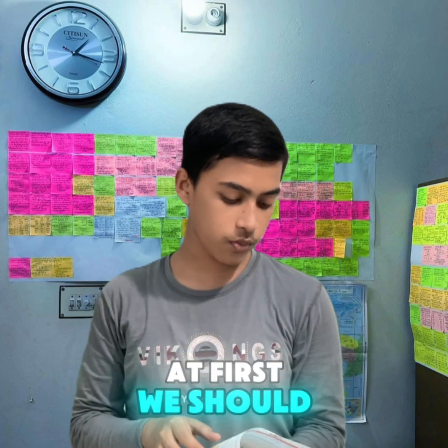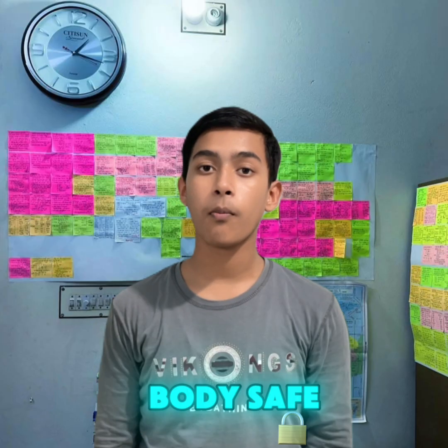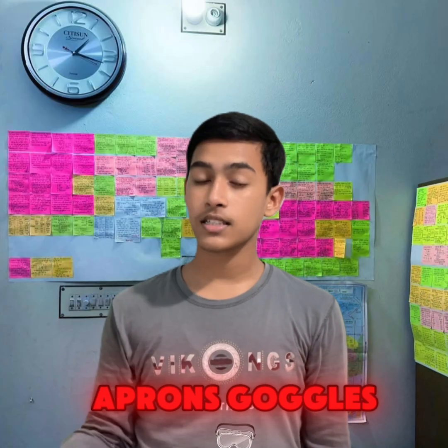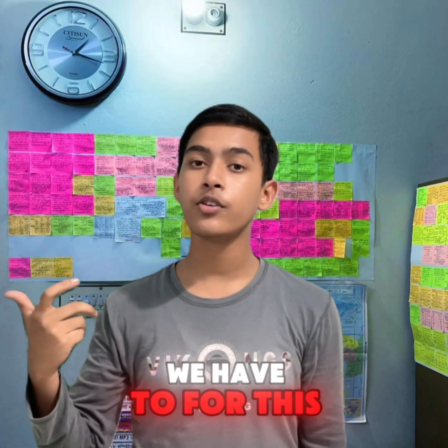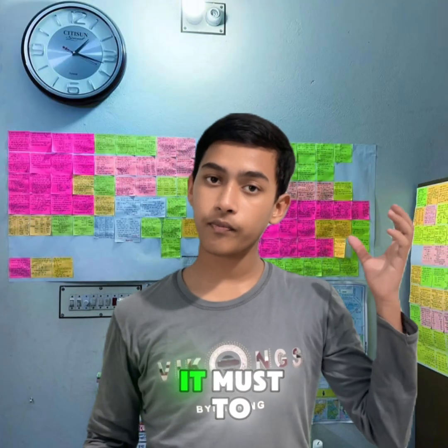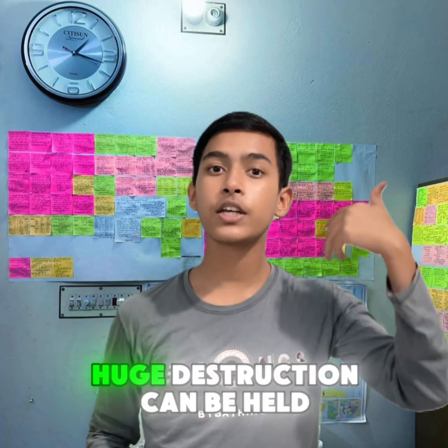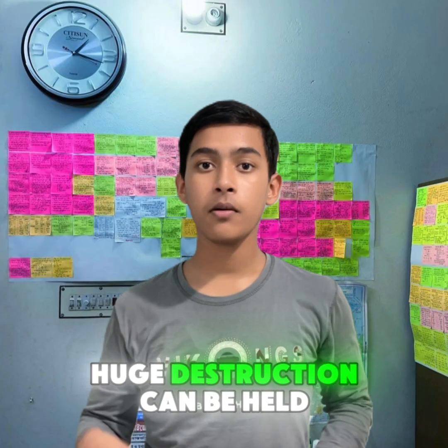At first we should take some protective measures to keep our body safe: aprons, goggles, hand gloves and masks. These are the basic needs for doing chemical research in chemistry. They must be taken and followed, and if these are not obeyed, huge destruction can occur.